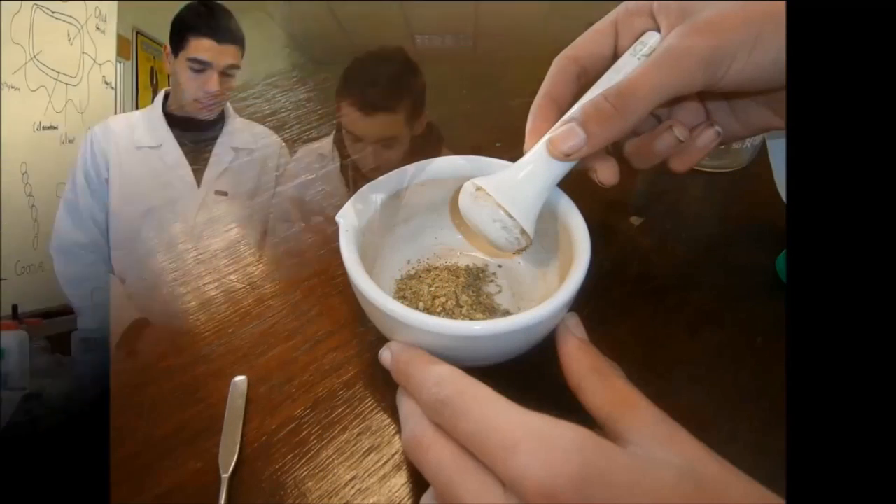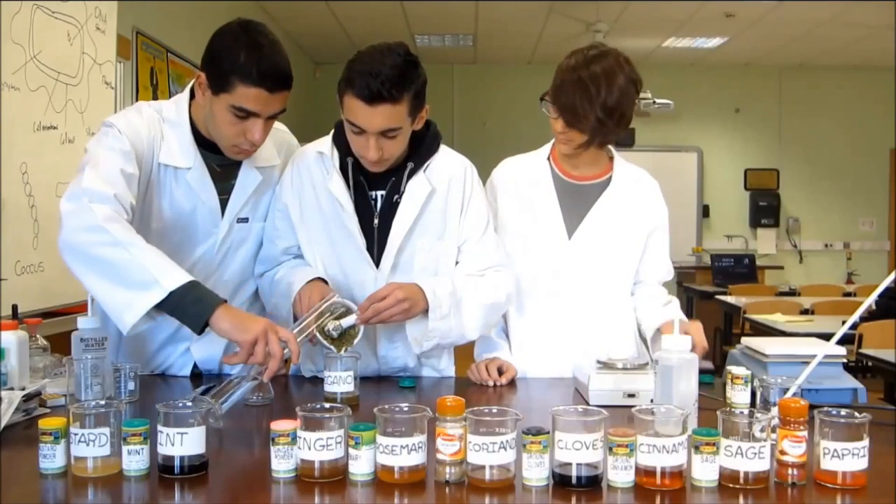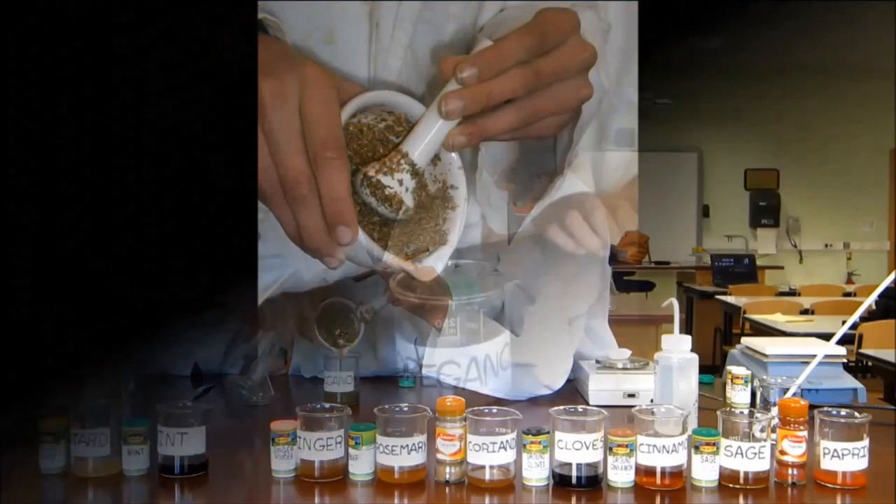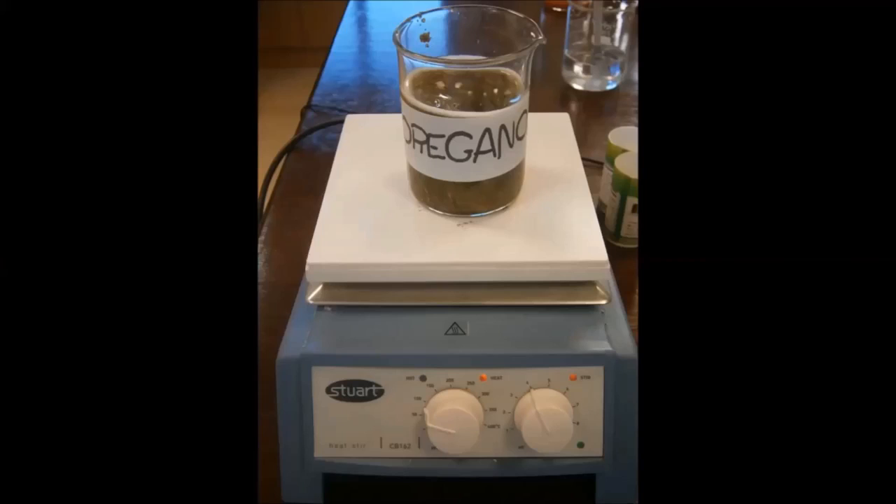In order to do this, 150 milliliters of distilled water are added to 15 grams of ground dried plant, and the mixture is stirred and heated for 20 minutes. The mixture is then filtered and the extract is obtained.